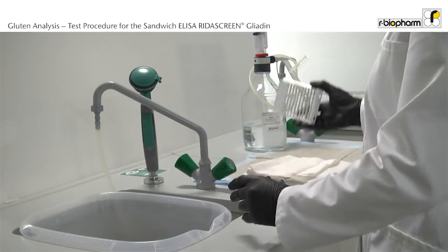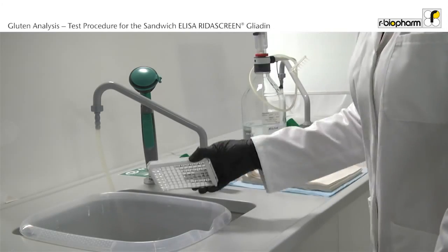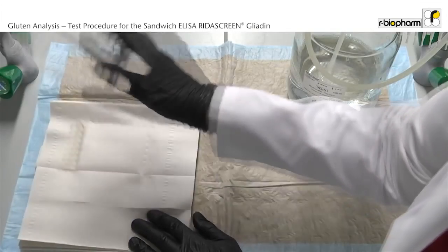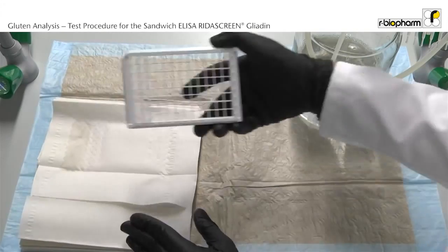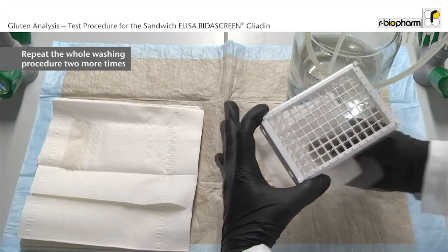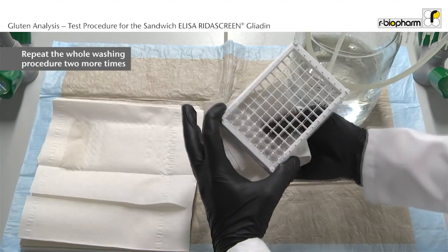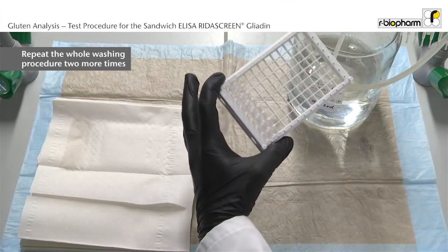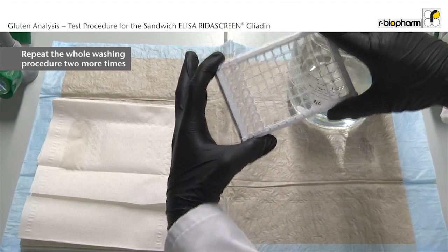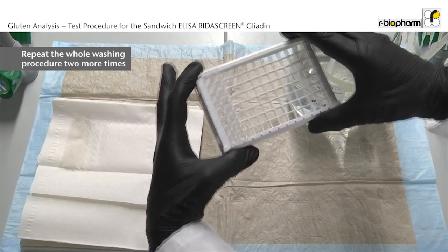Discard the liquid from the wells using an angular and forceful motion to properly remove all liquid content. Repeat the washing step 2 more times. Also make sure to absorb any liquid from the plate frame and outside bottom of the wells. At the end, visually inspect the wells for residual wash buffer or bubbles and repeat tapping if necessary.